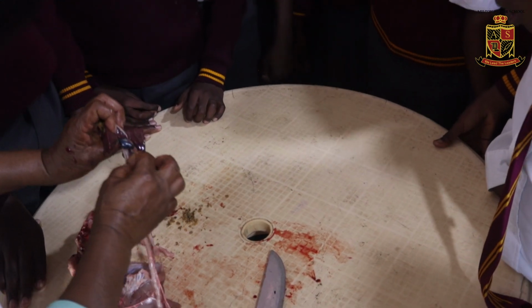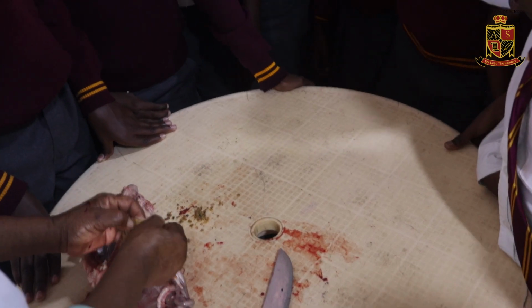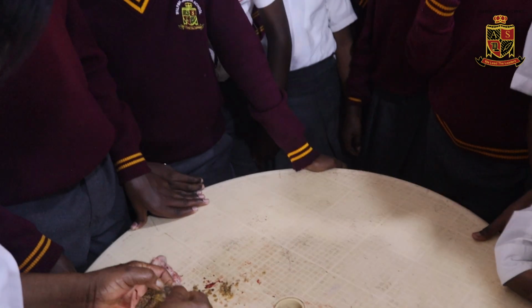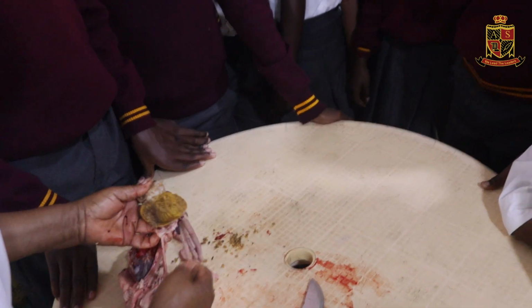This is the liver. Our main concern was to see where the food will be distributed to those parts of the digestive system, okay? Yes, so there we are.